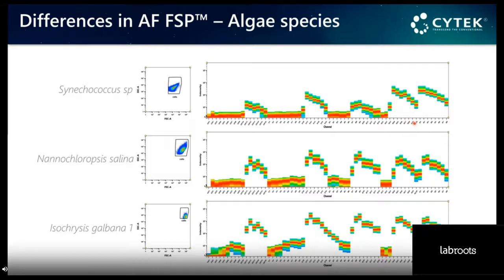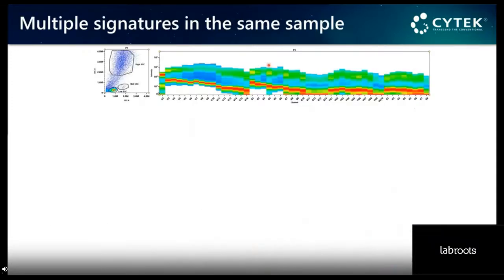And the important part is that now, without adding any staining, you can start characterizing these samples and understanding how things change, how the emission changes when the cyanobacteria are treated, when they are exposed to different microenvironments. It's important that autofluorescence helps you not only to be able to extract it, but also to understand your system without any additional stain. And this is a situation that you might have been seeing on your samples already.